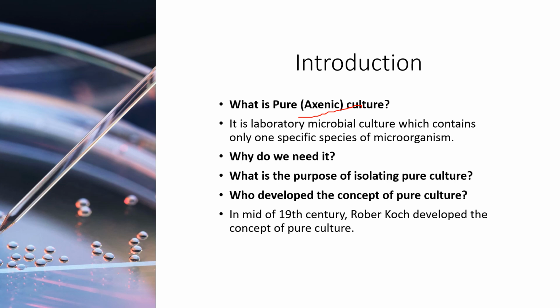What is the purpose of isolating pure culture? The purpose of isolating pure culture is to study, explore, and utilize the microorganism. It is necessary to obtain them in the form of pure culture.